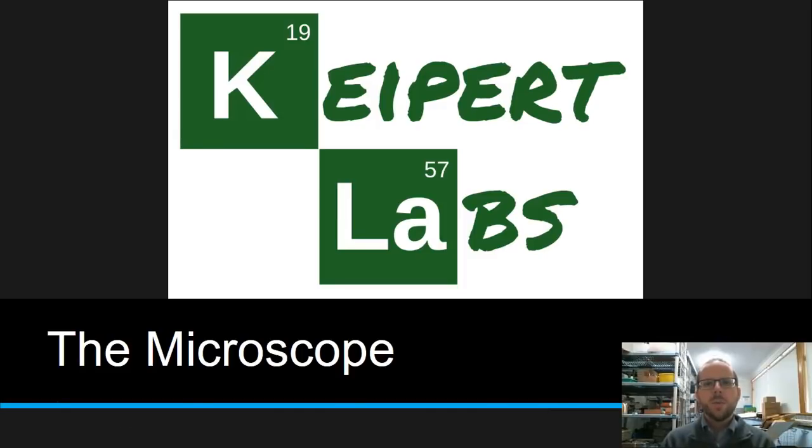In today's video we're going to look at the microscope, one of the key pieces of technology that we have used to understand more about how living things are put together from cells. So what are we going to cover in our video today? We're going to look at what we mean by a microscope. What is this piece of technology that we use?